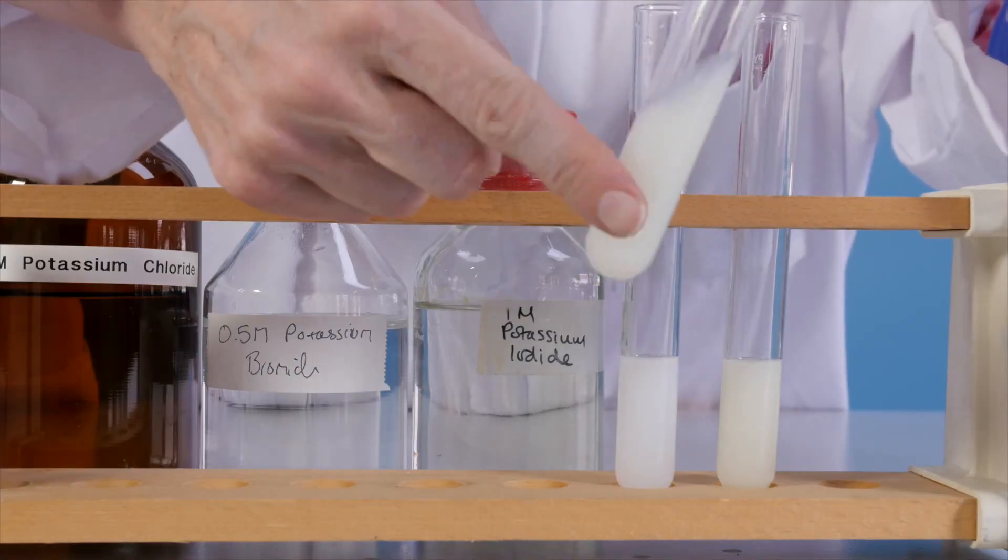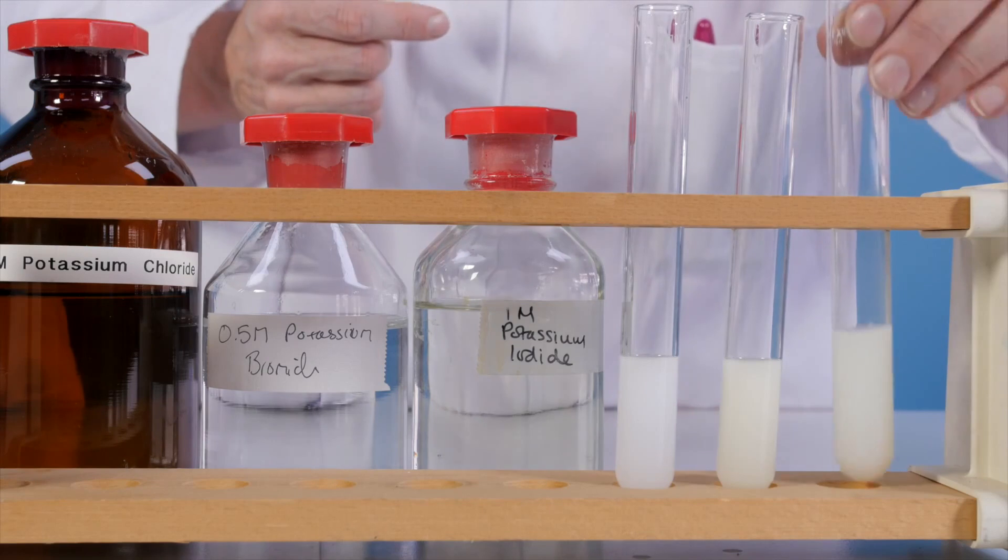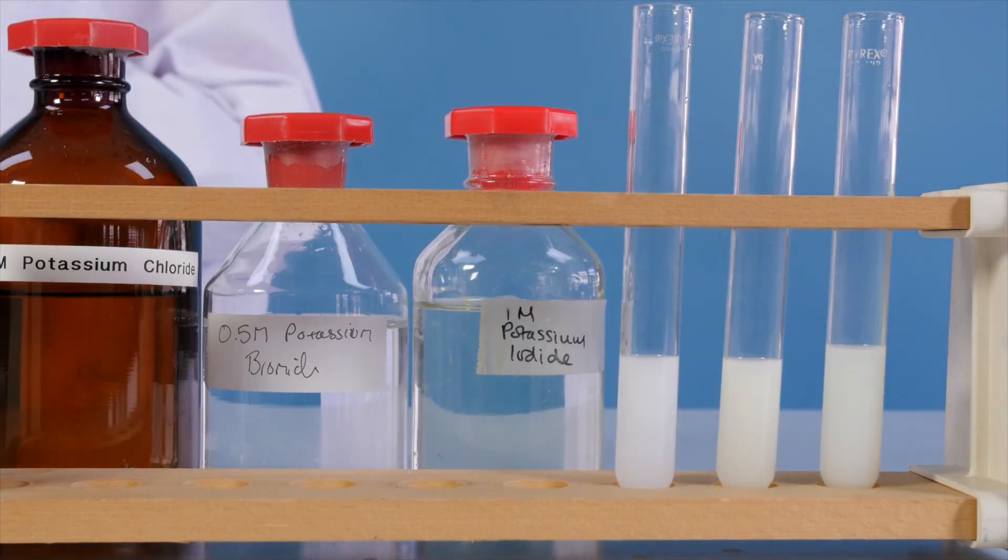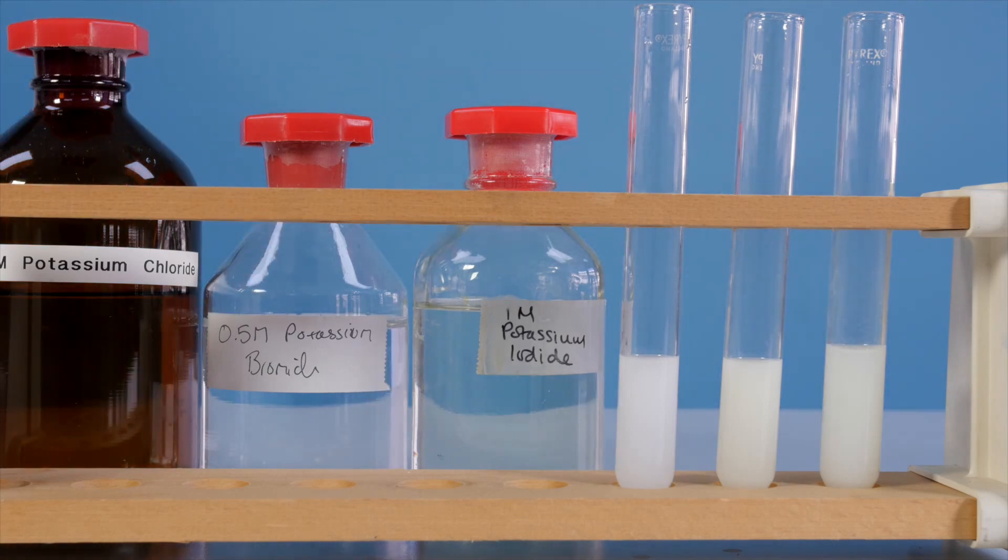Gently agitate each test tube and observe any precipitate that forms. In this case, a white precipitate forms with chloride ions, a cream precipitate with bromide ions and a yellow precipitate with iodide ions. Record your observations.